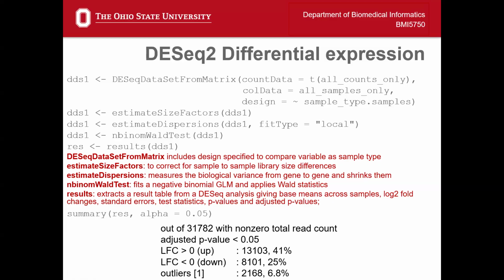And this first and second group is very important to set. Otherwise, it's going to be alphabetical. We set the groupings with a factor. We factor our column, we set the levels so that our primary group is like our disease group, and our secondary group is whatever we want that control to be.